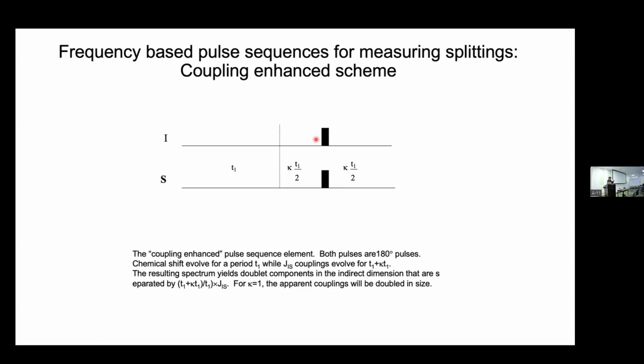So there's a trade-off here. The duration of the sequence is long, so you're getting relaxation. But you're deciding, I care more about the J coupling than I do the chemical shifts. It's a trade-off. You can choose to do that. Now you're going to lose chemical shift resolution because you could have used the whole period to allow a longer chemical shift evolution, ultimately. But the trade-off is you get better scalar coupling.